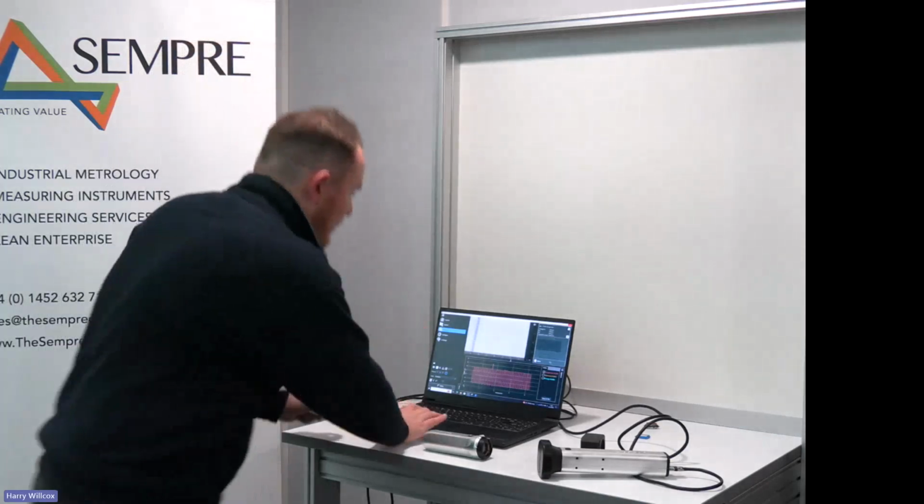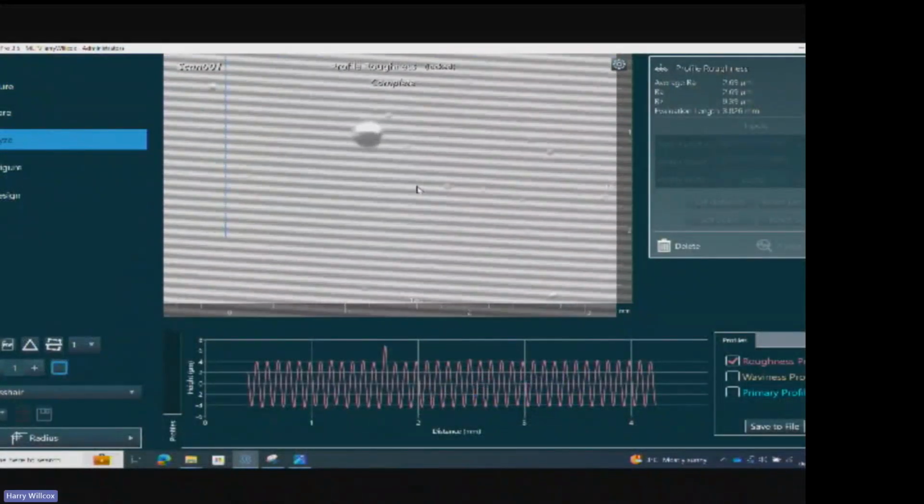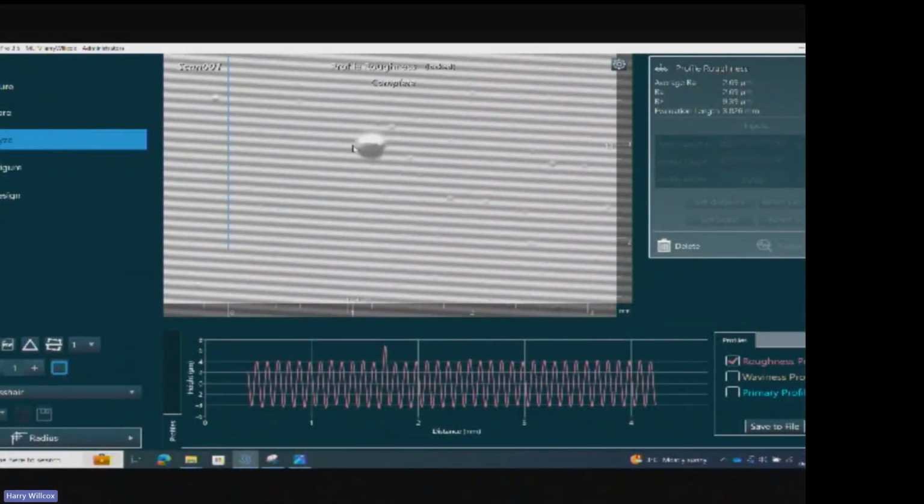You can see on my Gelsight Max here, in the software, I've got a small piece of debris that's been induced into the measurement. I know it's on the pad because you can tell by the shape of it, so we'd avoid that for the measurement. We run through a cleaning cycle, and in theory, the next time I go to measure, we wouldn't have that debris.